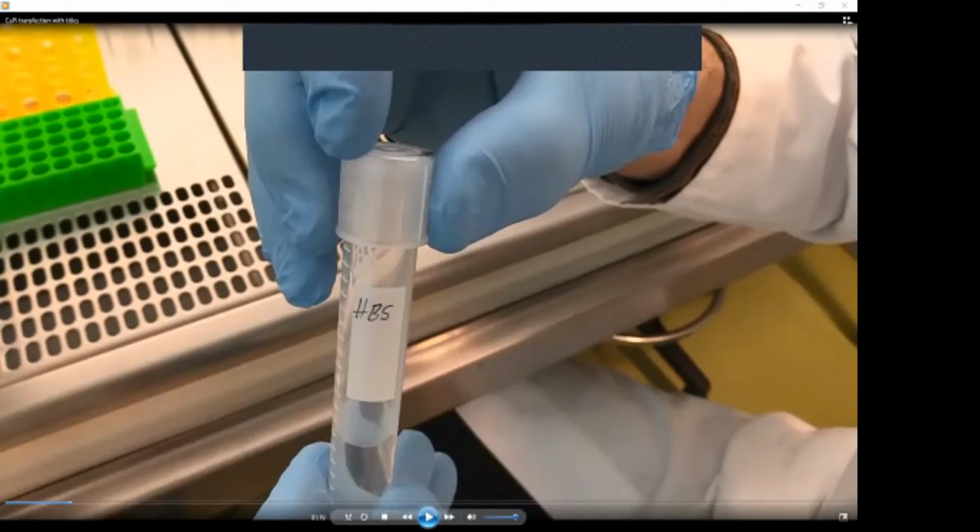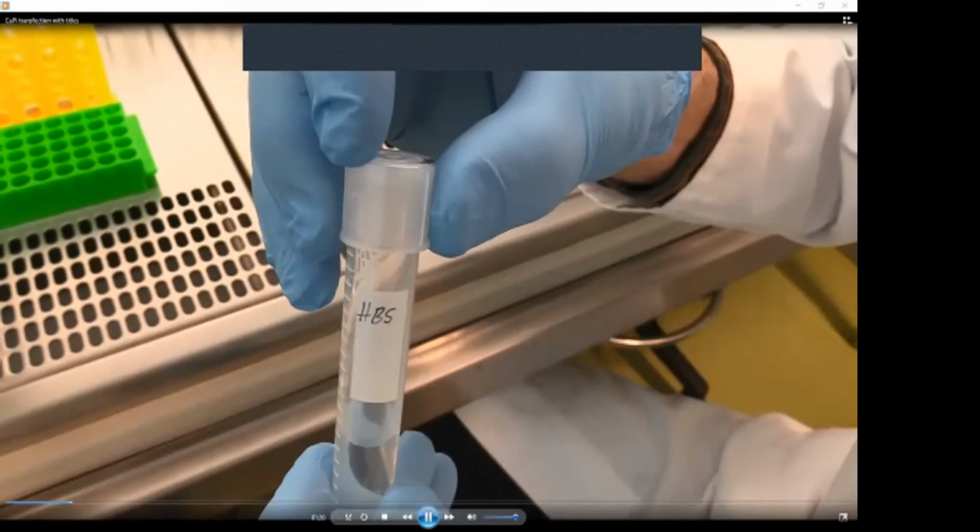What you see is one of the reagents which are necessary for the calcium phosphate transfection, and this is the HEPES buffered saline solution. The protocol for this solution is easy to find, and it's necessary just to have the optimal pH. This is very important when you do it yourself. It has to be tested because this affects the efficiency very strongly. This solution is aliquoted at -20 degrees, and each aliquot is used only once.